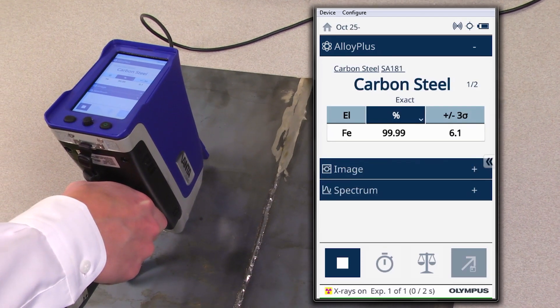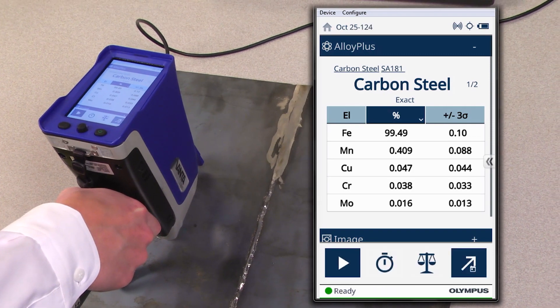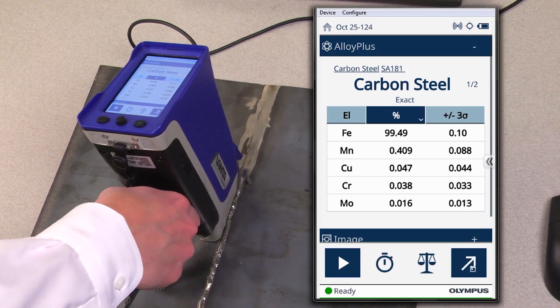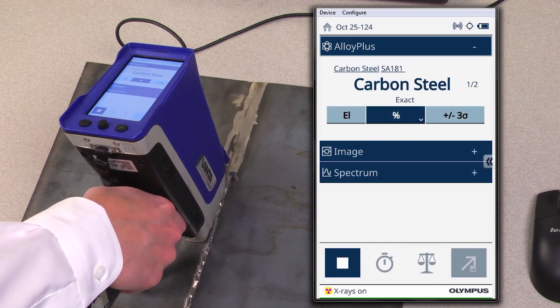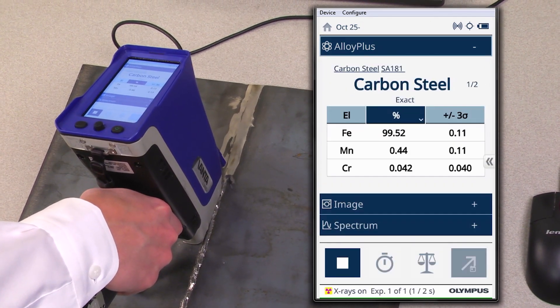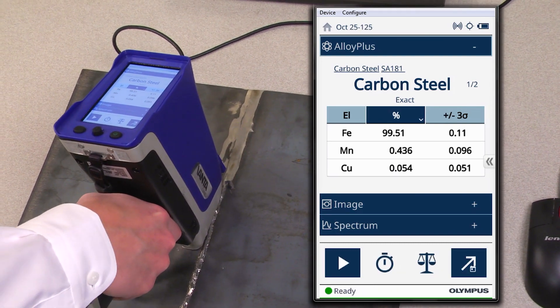For the base material test, you can see that we have a carbon steel match. And then as you walk the Vanta closer to the weld, you can account for any heat affected zone issues that might occur during welding and look for depletion of alloying elements, which I'm not seeing any here.